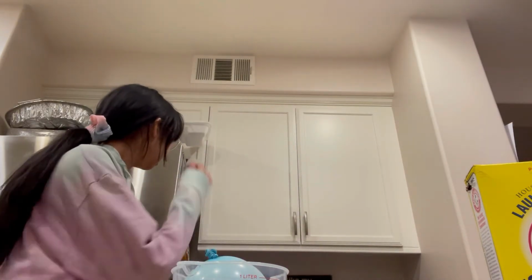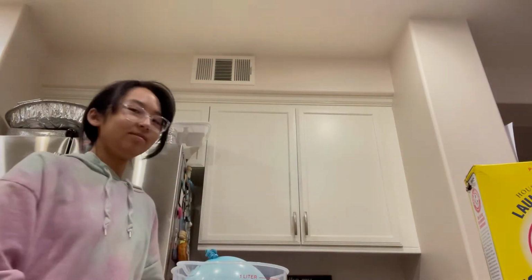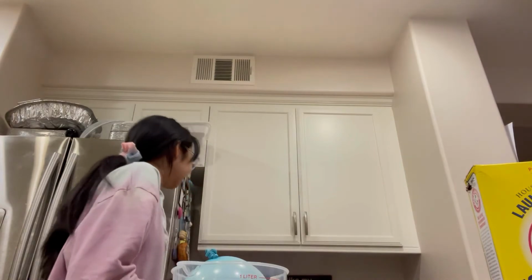Now, I'm just gonna very quickly heat up the water again, so it is boiling, and it's good. Okay. I now have a small amount of boiling water. So what I'm going to do is pour this in here.